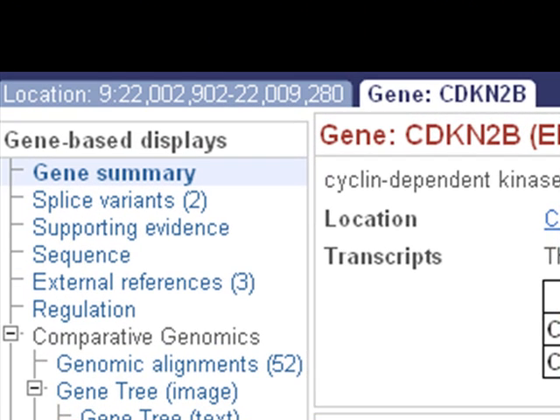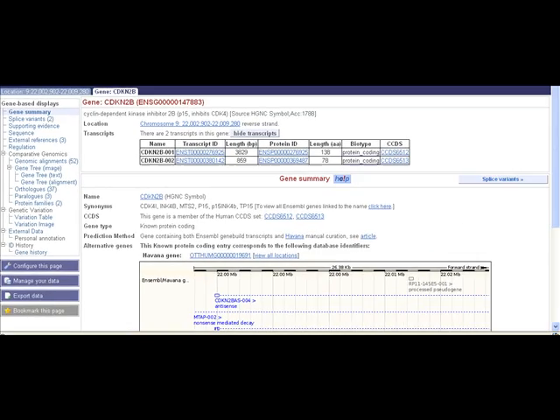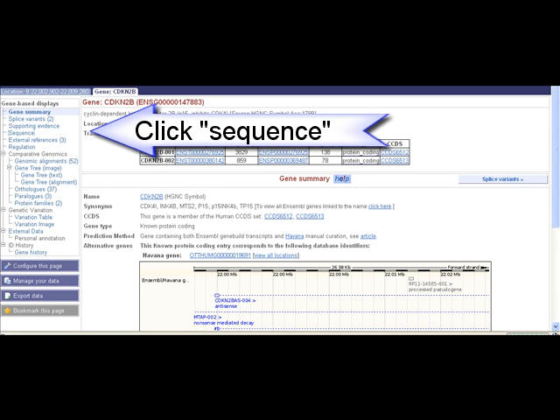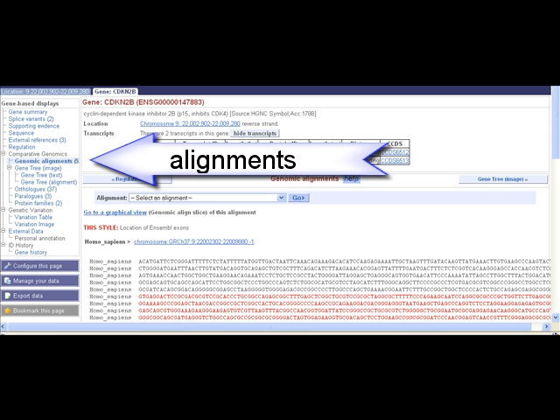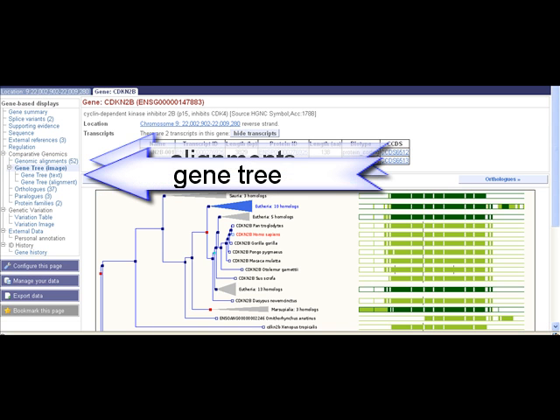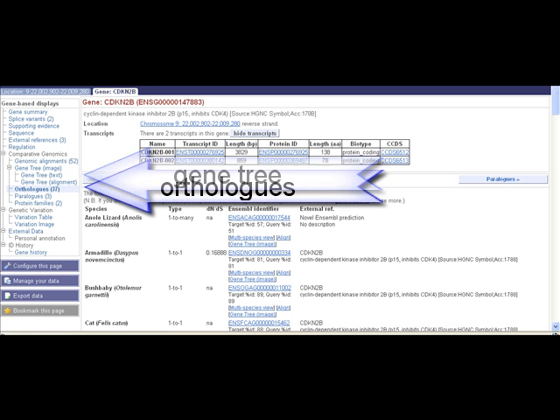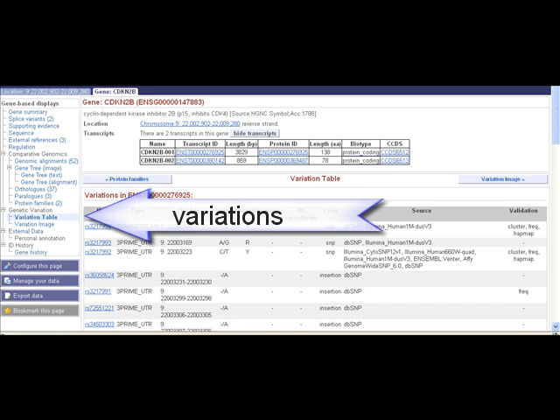The Ensembl views are separated into tabs. We are in the gene tab. Links at the left show specific information for the CDKN2B gene — for example, genomic sequence, sequence alignments, a gene tree, homology relationships, and variations.